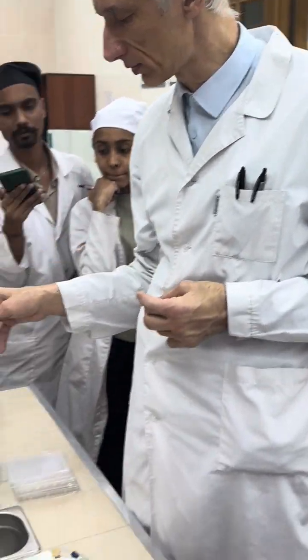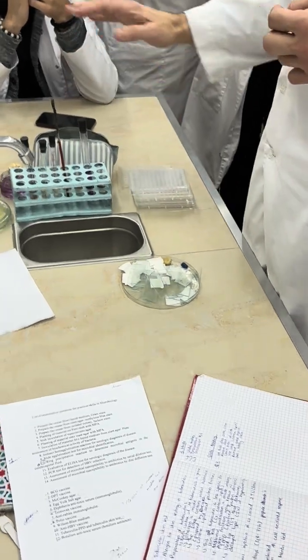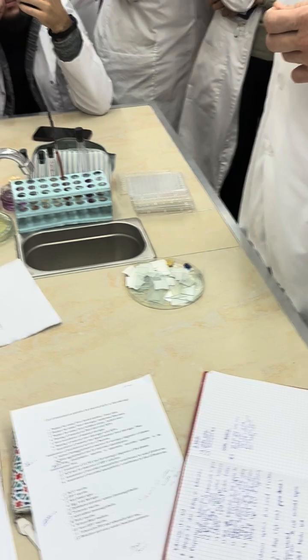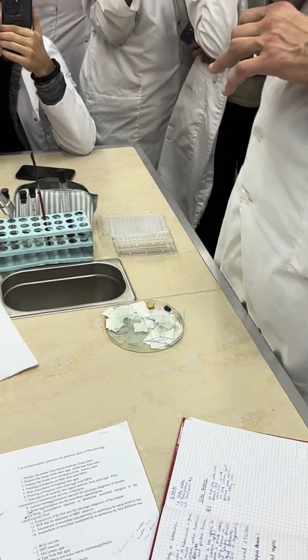By the way, I forgot to say the initial preliminary recommendation. So people, when you begin to work practically, please waste 1 minute to reorganize your working place. It should be comfortable for you, not for me, not for someone else. If you are right-handed, stand turned to it at a normal distance, closer to your right hand. It depends as you like, where you can put the tray, closer to your right side, or maybe the left side opposite, but for you.